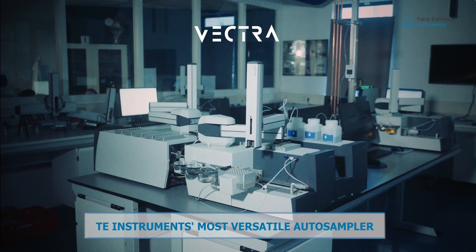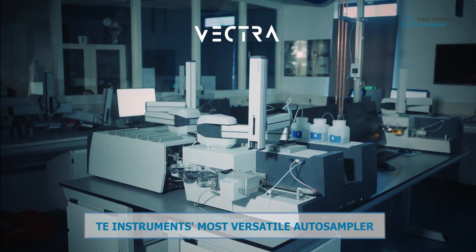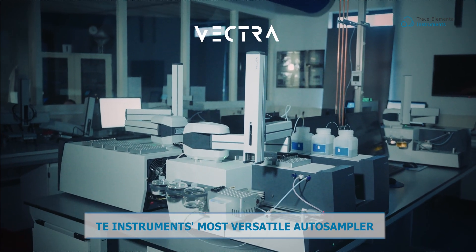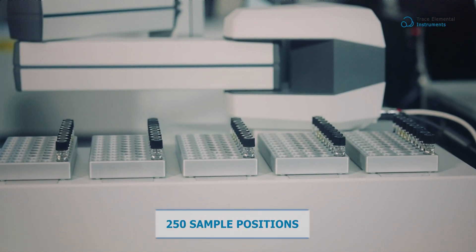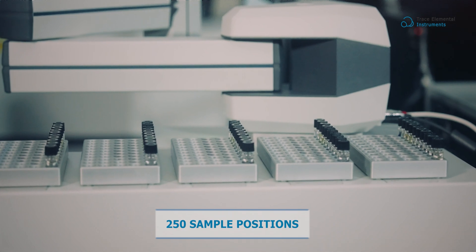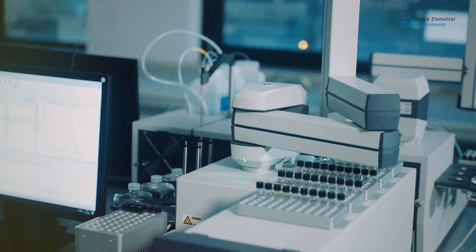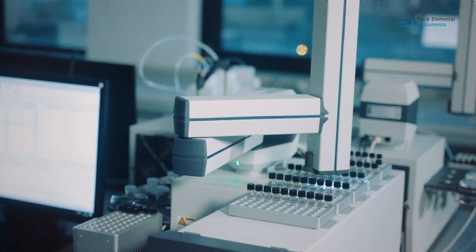Experience higher workflow, enhanced flexibility, and top-notch performance, all within a small autosampler. With a high sample capacity of up to 250 positions and 100 additional positions for conditioned samples, Vectra sets a new standard for efficiency and productivity.